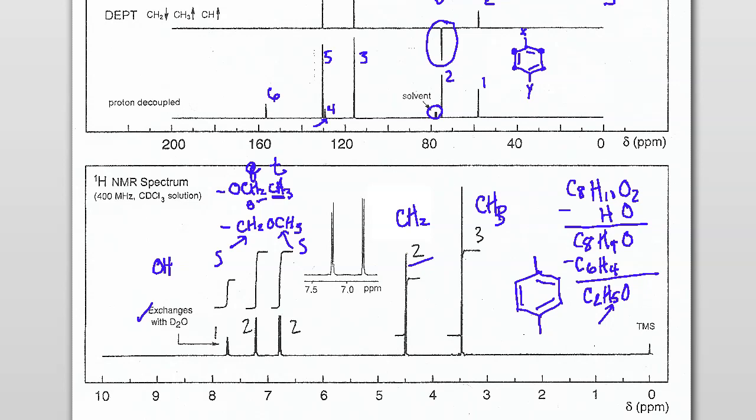Those are way too high for the first option up here. So we are left with absolutely the CH2OCH3 as the ether. So what you would do at this point is assemble the rest of the molecule, and you would have OH, and then you would have CH2OCH3, and that is the final structure that you would work with.